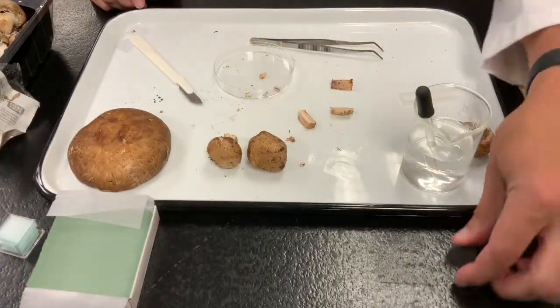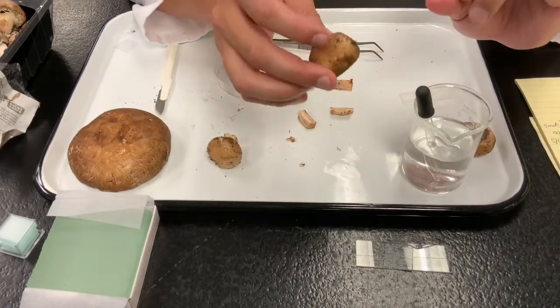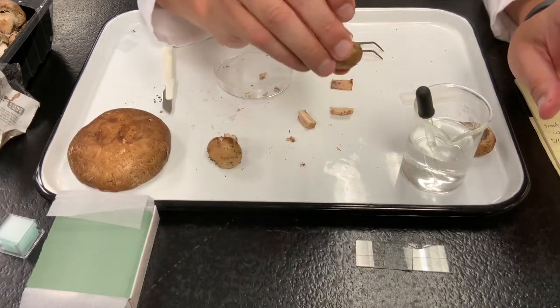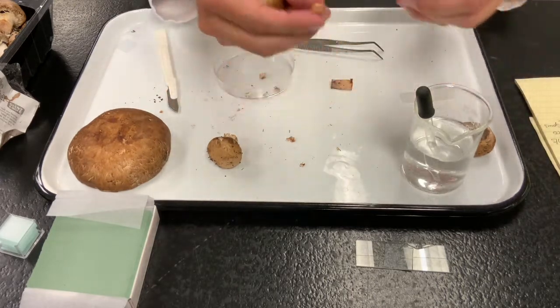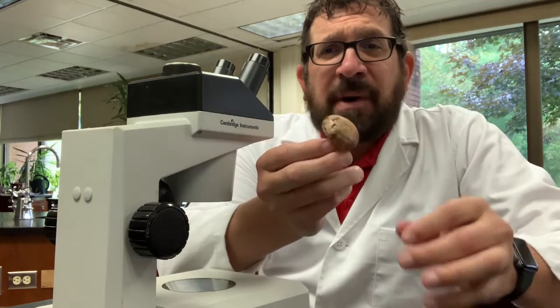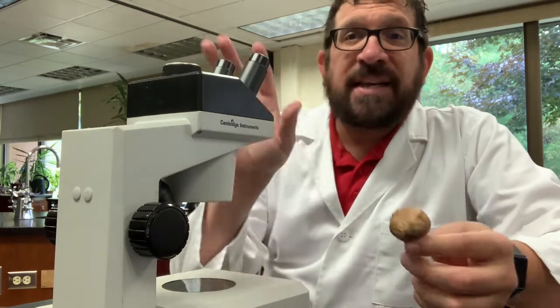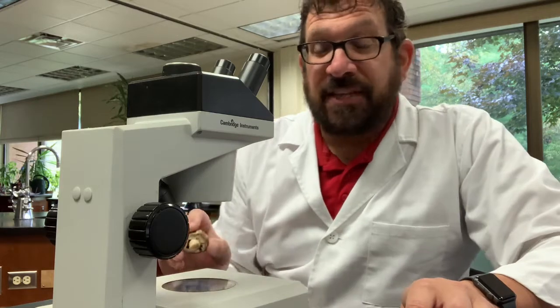Before we take our slide over to the microscope, let's just examine what the mushroom looks like underneath our stereoscopes. Our stereoscopes are used for three-dimensional objects such as these, and for us to get a look at. So I'll take a look at the different pieces we have here, and you can see what I'm looking at. First thing I'm going to look at is just the overall entire mushroom. I'm going to look at the different pieces and parts. I will take some photographs of what I see through here, so you know what this looks like under different magnifications, and a lot closer than what your eyes can see.